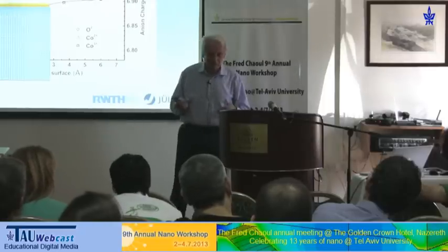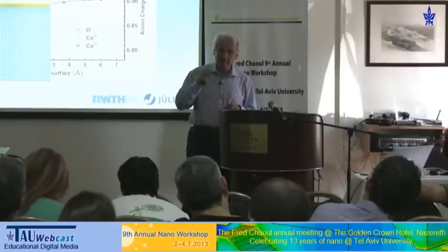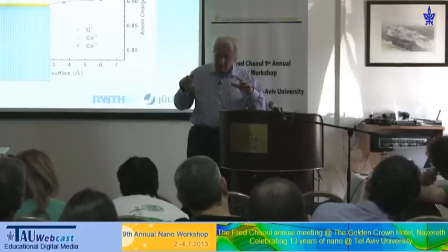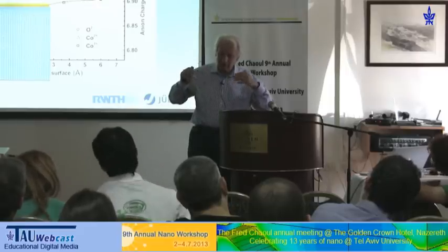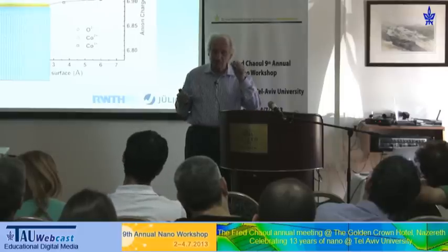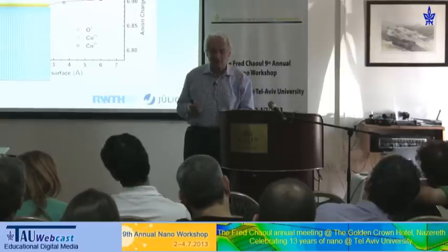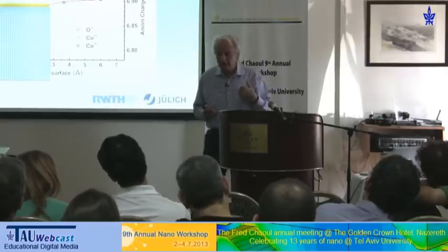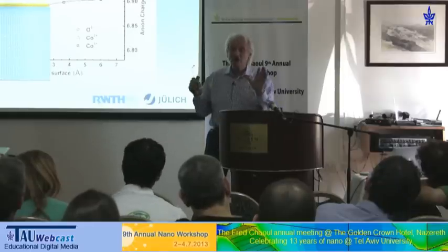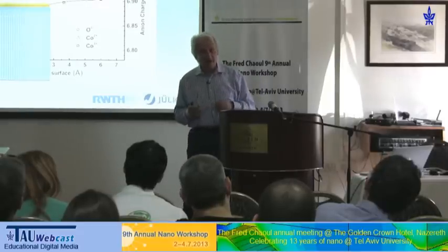When we go to amorphous materials, we of course have the advantage that, when you normally have a microscope with spherical aberration, this spherical aberration always leads to this point spread. The point is just expanded into something else. We call this delocalization. So when you have a microscope with spherical aberration correction, delocalization goes away. And this opens up the way to investigate glassy materials.